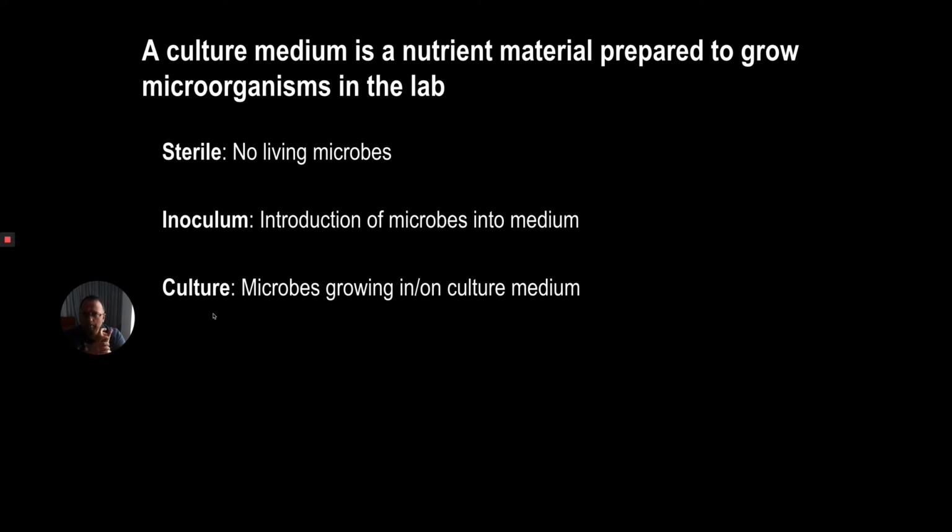is sterile. Then we have the idea of inoculum, right? So if I have a sterile medium and I am now adding that microbe into the medium sterilely via inoculation, and then culture is when the microbe has grown in or on the culture medium.